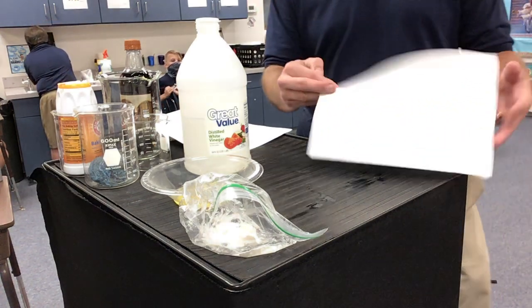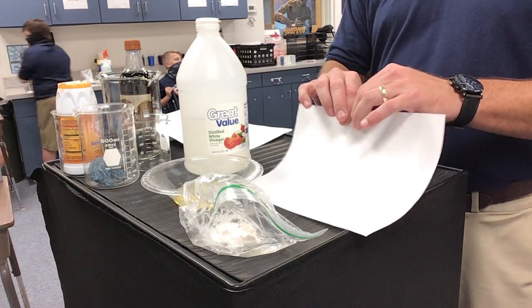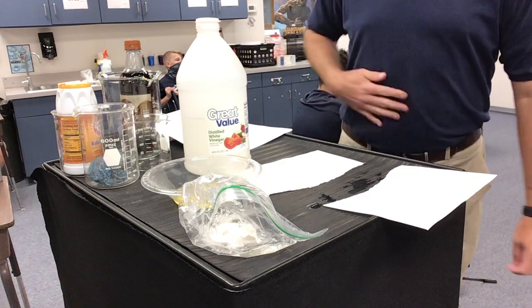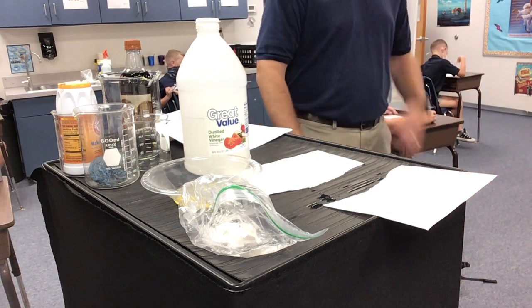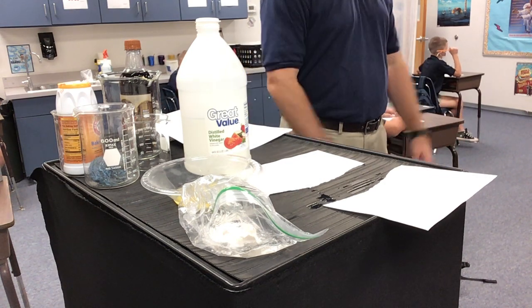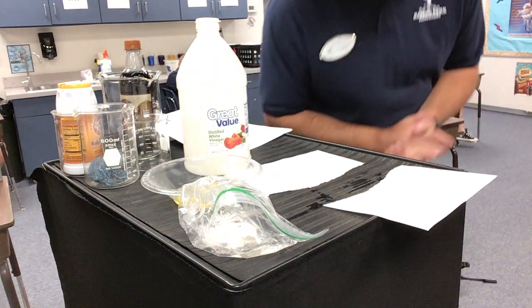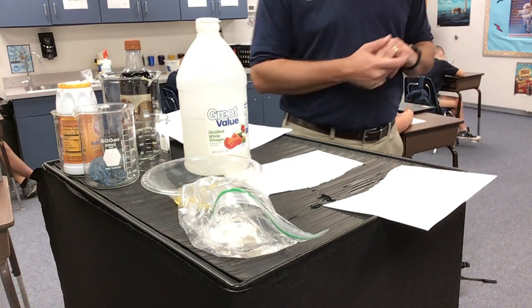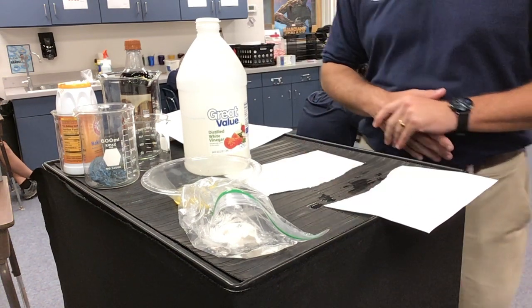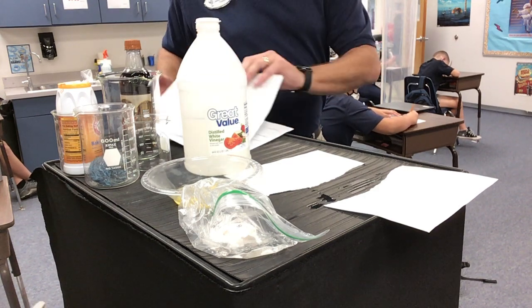Next thing, I got a piece of paper here. Ready? Did it change? And now you can check and see, was there a color change? Are we making bubbles? Is there an odor change? I don't smell anything. Temperature change? I don't feel anything. Is there a new physical property?